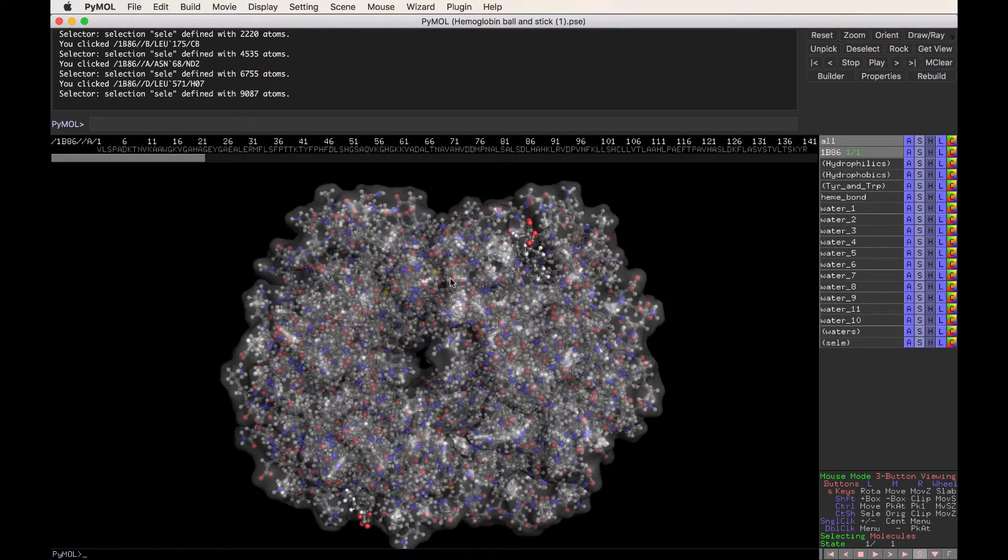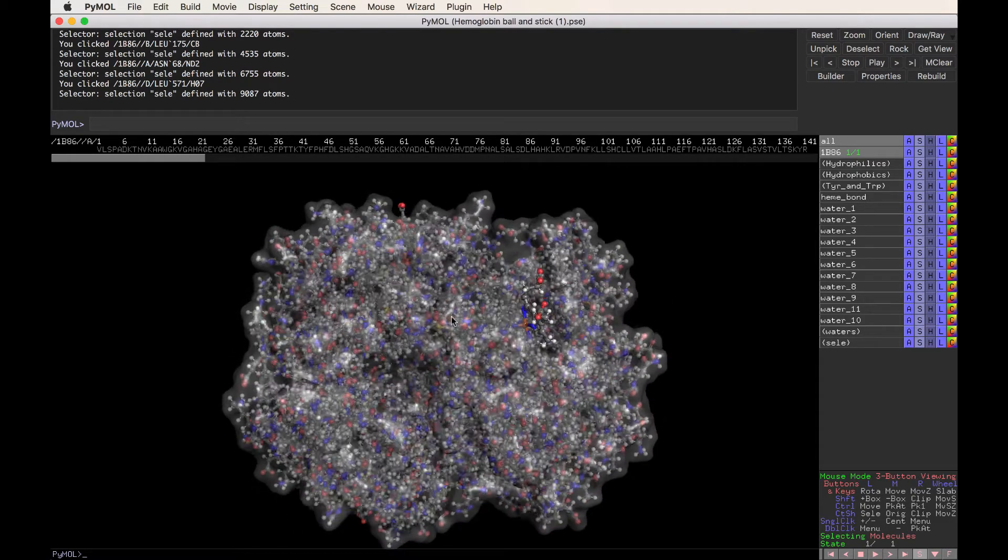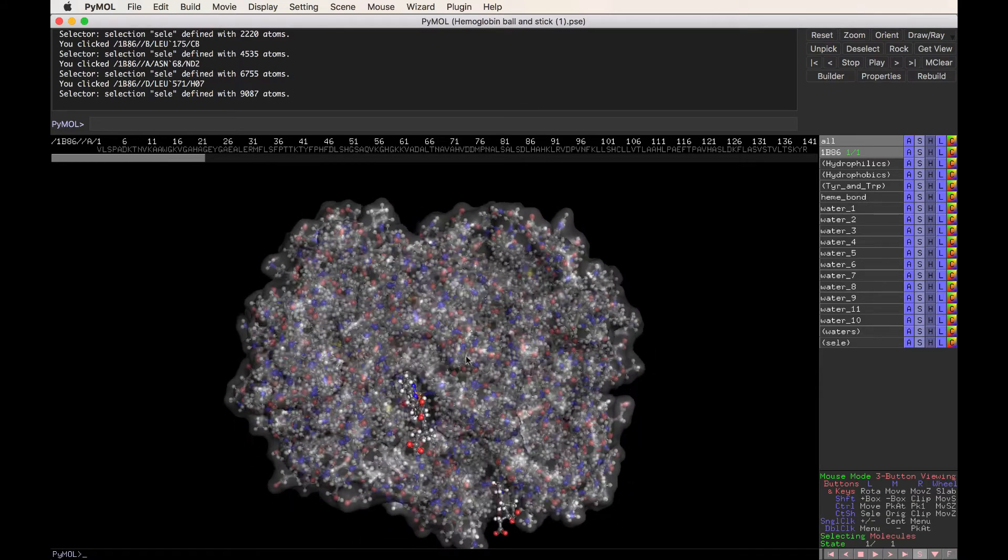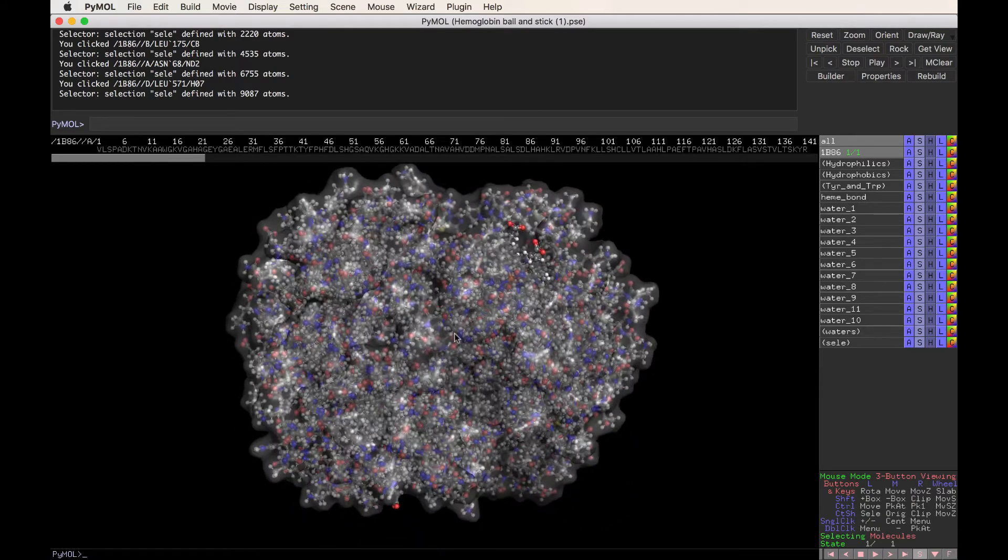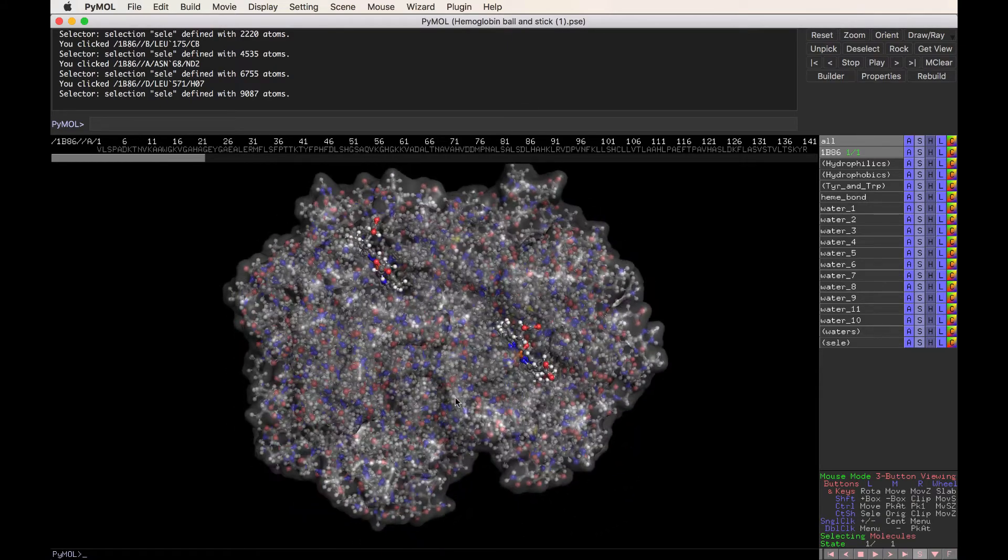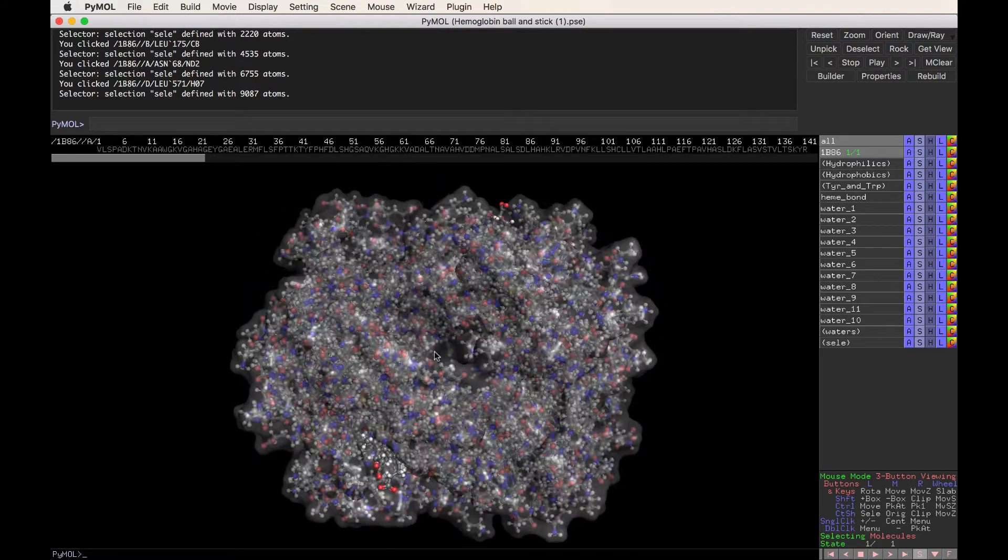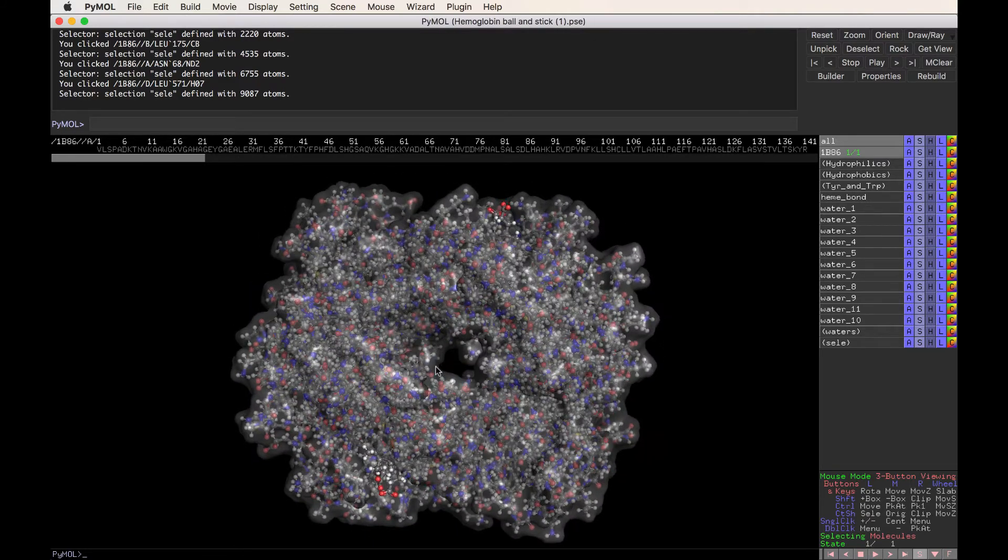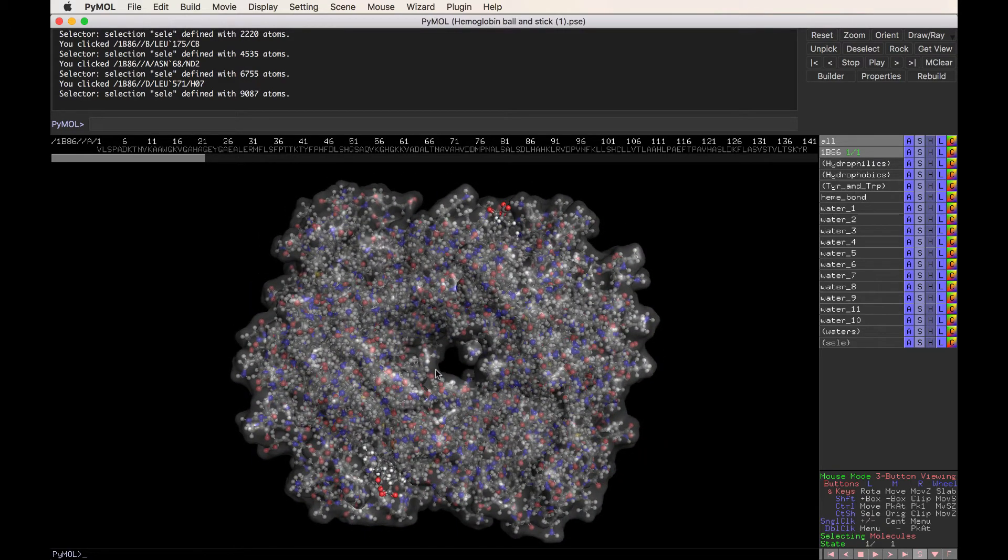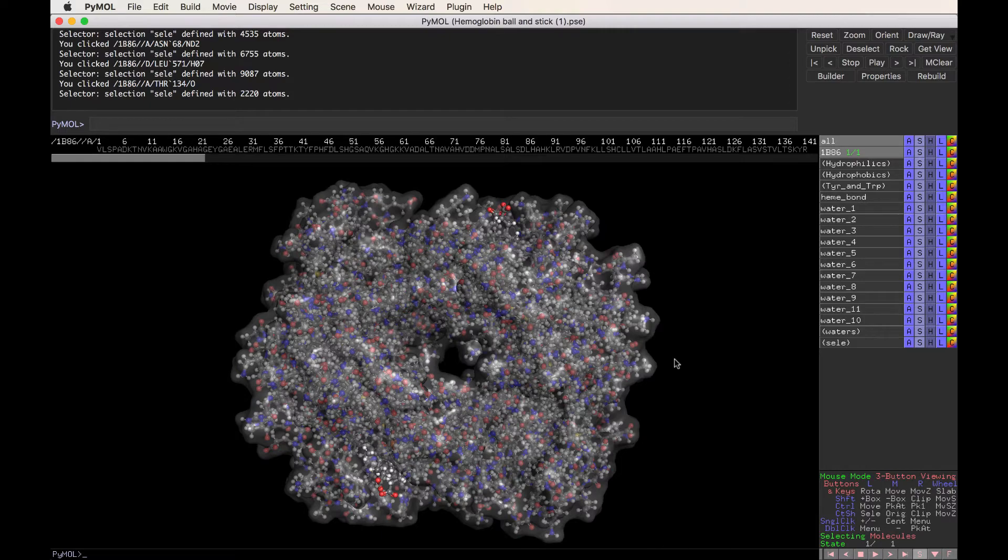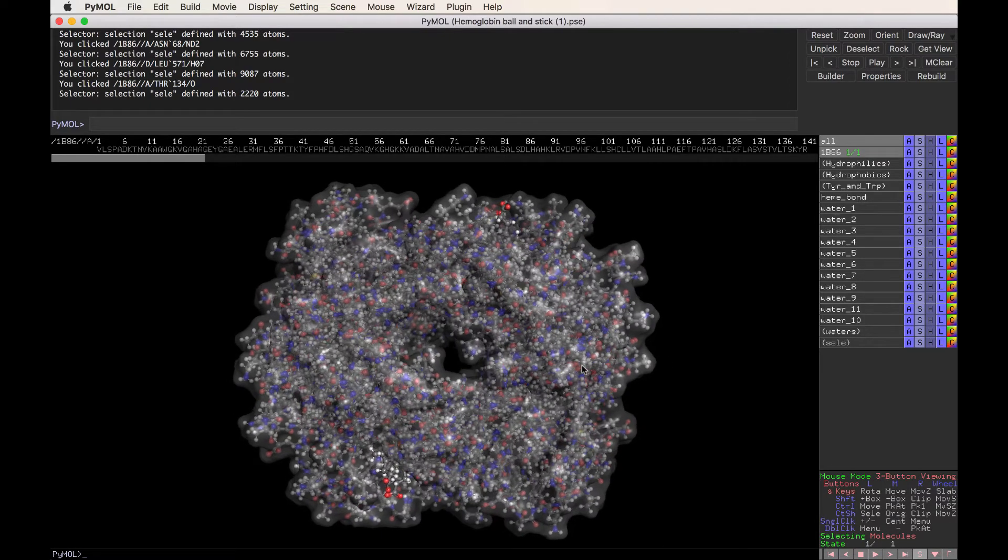One other thing that we notice is that there are actually four hemes. One, two, three, four. So that means that this molecule carries four oxygen molecules. The entire purpose of this molecule is nothing more than to carry four oxygen molecules in our blood. I think that's pretty amazing.